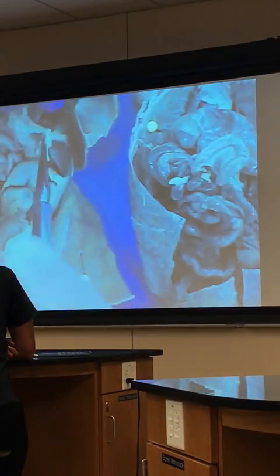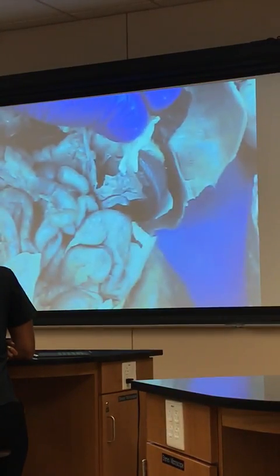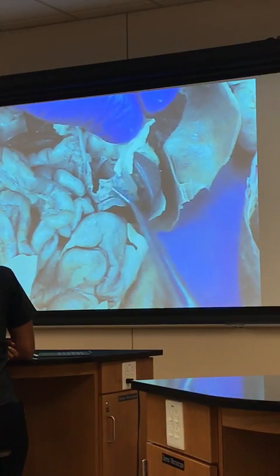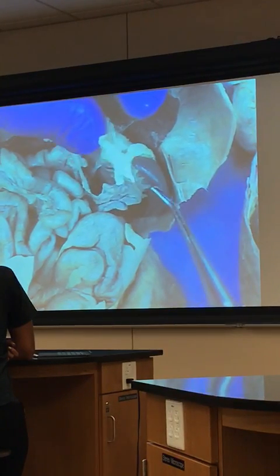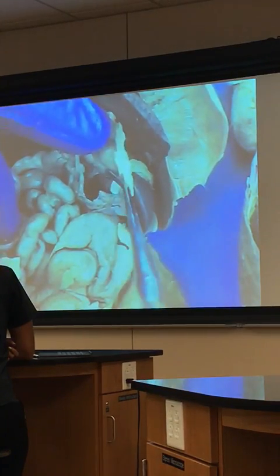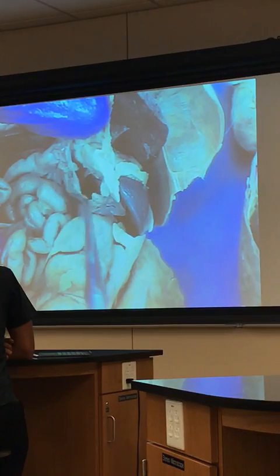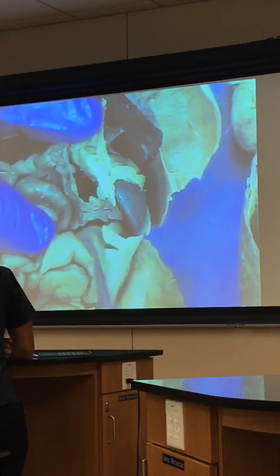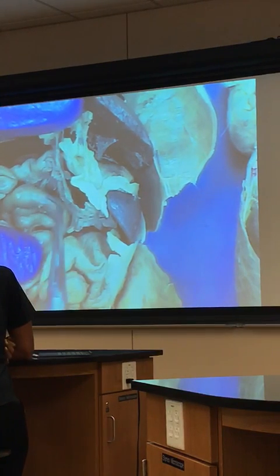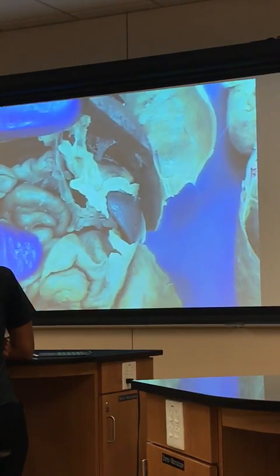See the pancreas. Oh, here we go. Here's the pancreas right here. All right, so this one's a little bit easier. You can see part of the pancreas over here, right? Here's the spleen. Here's the pancreas. The stomach is right here. Here's more of the pancreas. So you can see how pretty diffuse the pancreas is right there. And here's a large intestine right here. You can tell because here's a rat dropping right there as well.